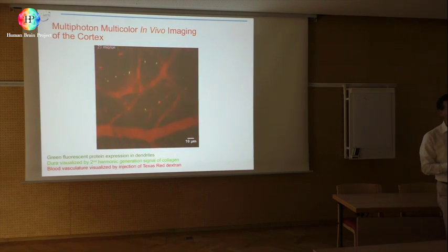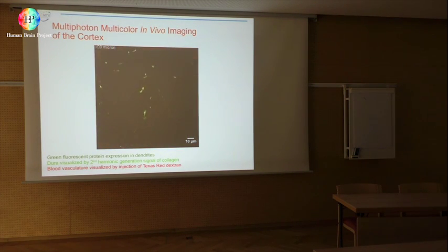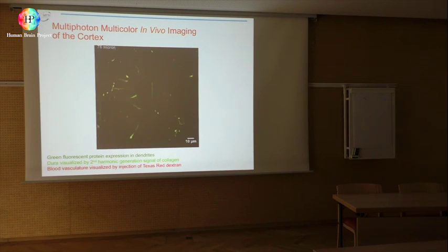Another very big advantage of 2 photon excitation with respect to 1 photon is that the cross-section of absorption of different chromophores is excited with the same laser. So with the same laser here, you may excite more color. And then with proper filter and different photomultipliers, you may have a multicolor image in one shot. And this is pretty much convenient in many cases.